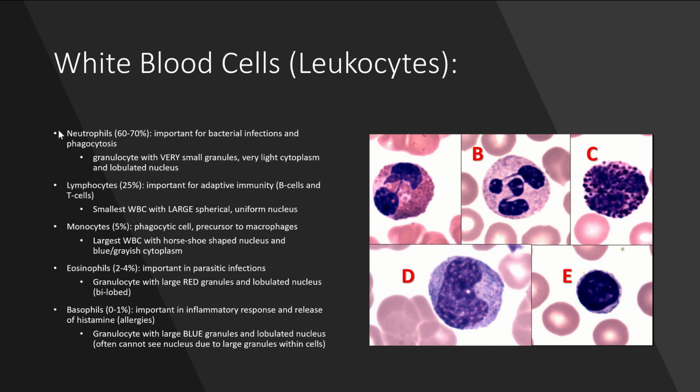And so that's how I remember them: neutrophils are very neutral. They have a very light cytoplasm. Okay, so the cytoplasm is very light. It's that normal pinkish. And then they do always have this segmented lobulated nucleus. So you'll see here it looks like there's maybe 4 nuclei within this one cell, but you can see that they actually do connect in these very small parts.